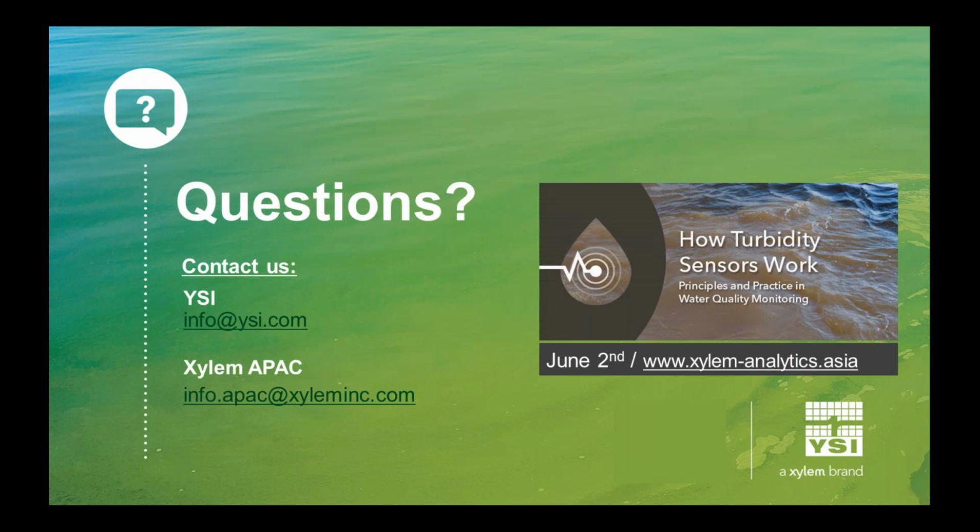And so I've seen this here in the American Midwest, where you'll have a scum of microcystis sitting on top of the lake, and just a few minutes later, it's pushed over into a cove because there's a prevailing wind, a southwesterly wind or something, that is just moving that algae. And that definitely can cause spikes in your data. Frankly, though, that's one of the reasons you do algae monitoring, is to see that.